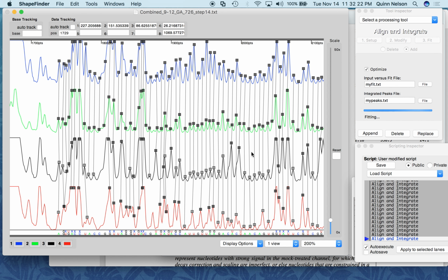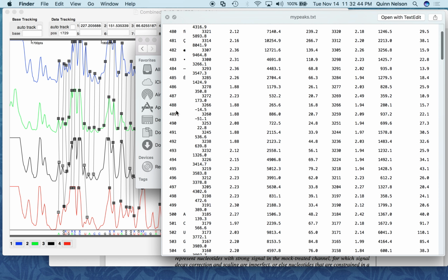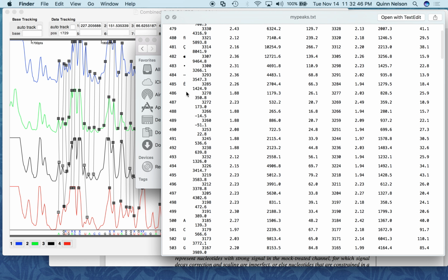That's really the key, the key function of a bioinformatics person: being able to understand data, and then what the data means in a biological setting. I'm not happy that there's no sequence here. There should be sequence. We have the ability to. Let's put it there. It's so easy. We need to take that step.